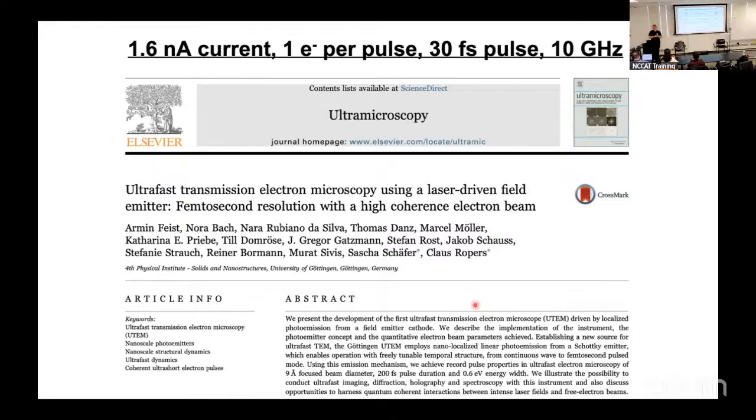The percentage I think we got is about 80%. The only reason we get 80 and not 100 is because in the results I'll show you today, and I think it was 80, it's around that. In the end, the way that we showed our proof of concept of our approach is the electrons are moving slightly slower than the laser beam. And so the electron packet is not one electron per packet, it's maybe 5 to 10 electrons. And so they're more spread out.